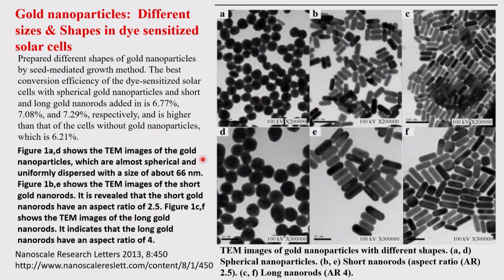Okay, so this is the TEM for these gold nanoparticles by using different kinds of synthetic methods, which is not a part of this particular course. You can synthesize one particular type of thing, or it can be even a mixture. So you can change the conditions and convert the mixture into one single.